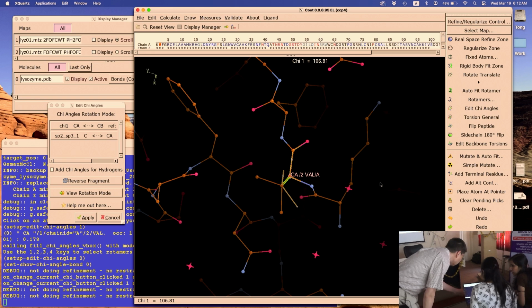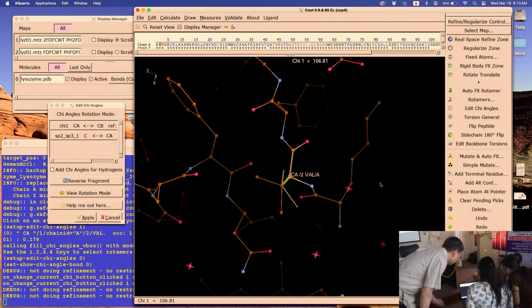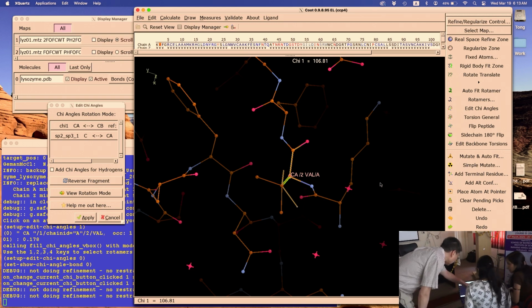No, no, you can't go out of this? Yeah, click on that. So you have to maybe drag this out of the way a little bit. Drag this out of the way to put it to the left. So how to drag here? Drag the top. Yeah, there you go.